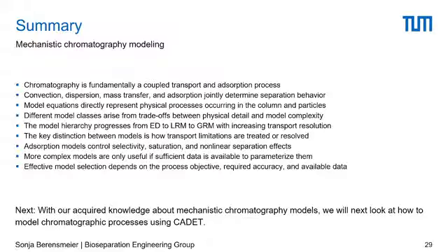So again, as already talked about in the basic introduction to modeling, the effective model selection really depends on the objective. What do you want to achieve with your process? How accurate does the model have to be? And what amount of data or what data do I have?